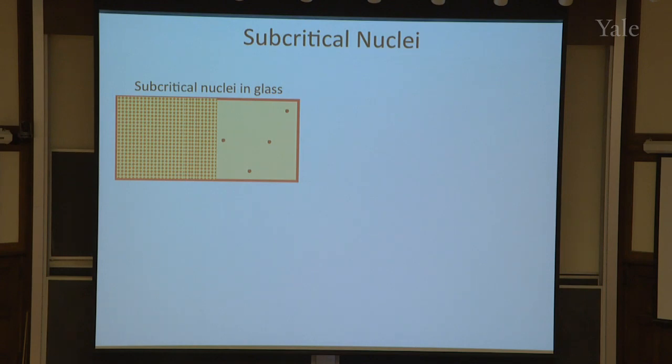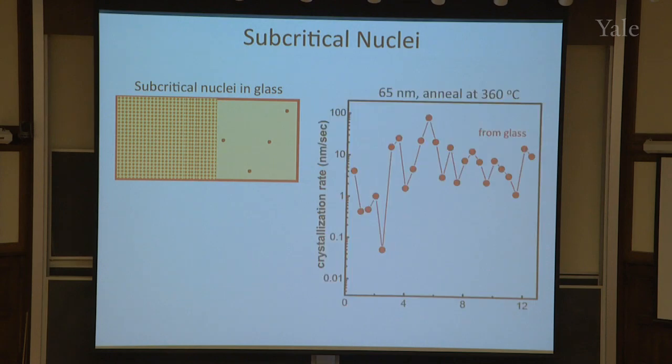That's our hypothesis. Maybe that's why the growth rate is not constant but fluctuates, because every time you hit some sort of substructure, you enhance your growth rate. And maybe the way these are located is random, and that's why it fluctuates. So how do I test my hypothesis?